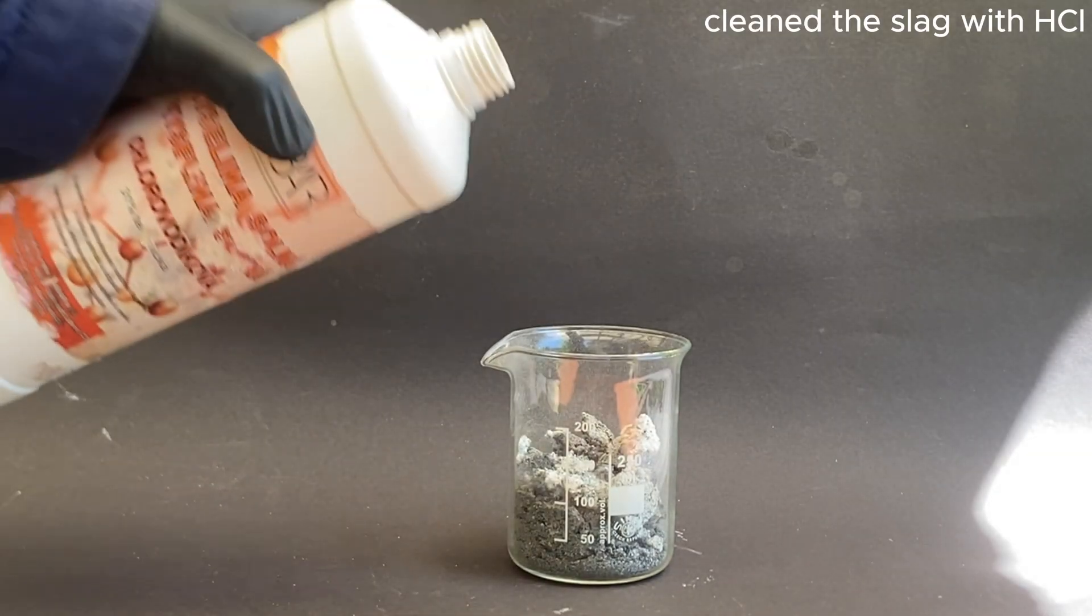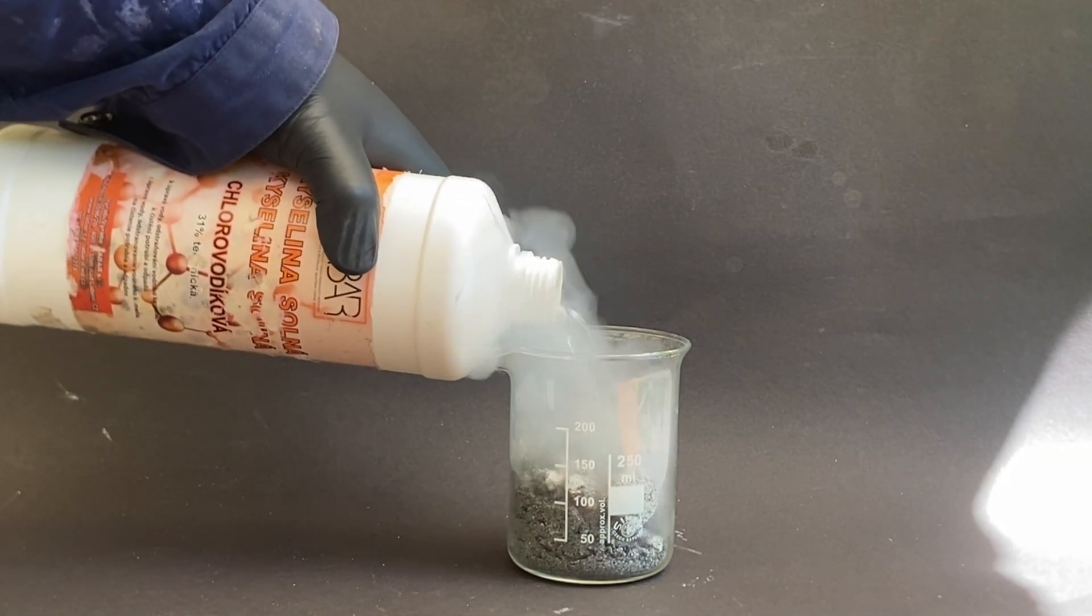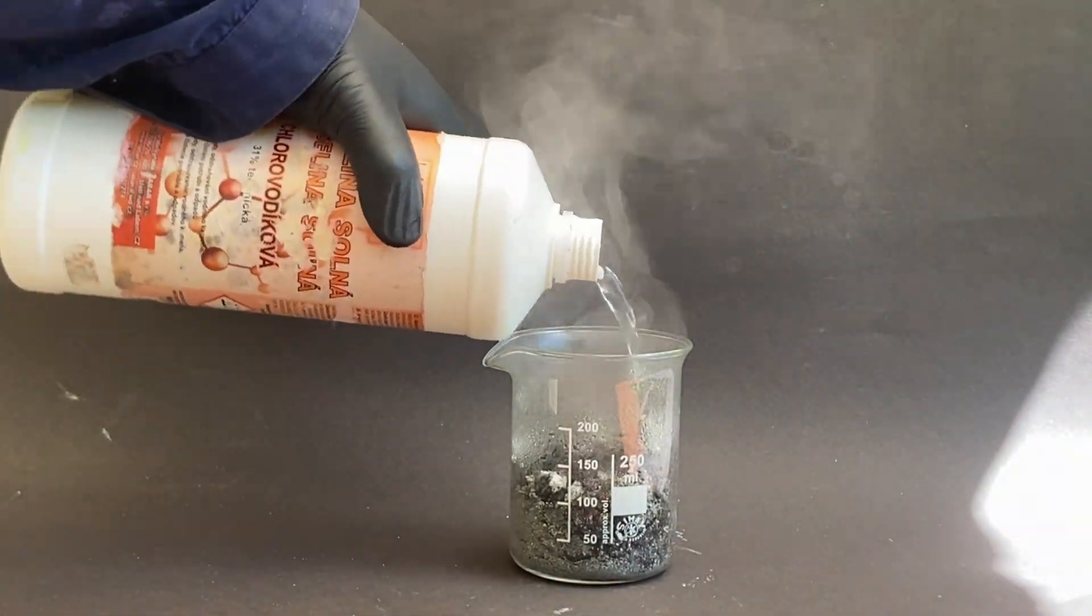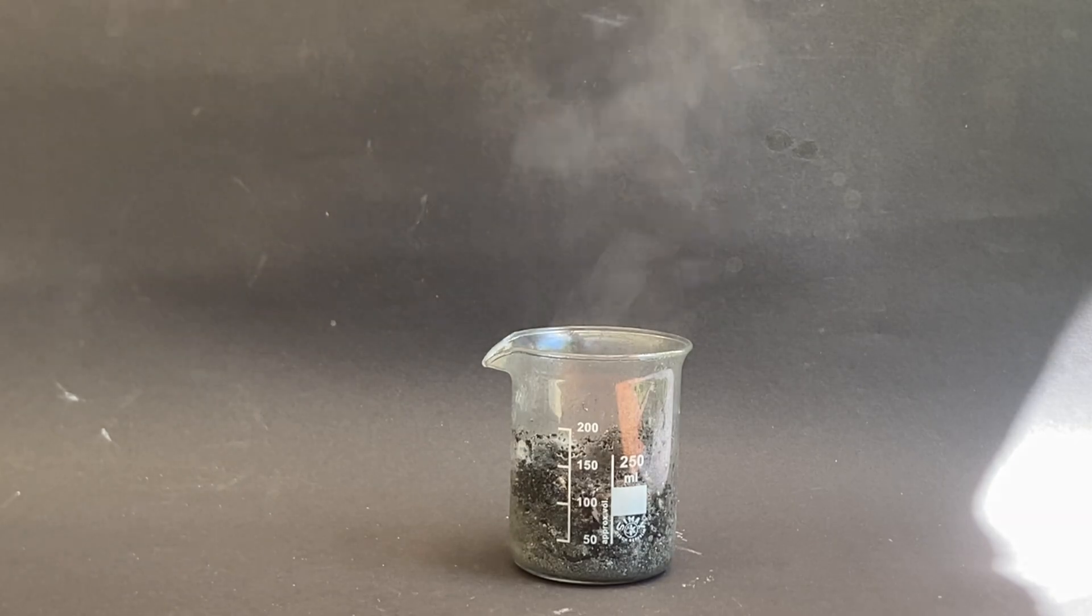Next I dissolved the magnesium oxide in hydrochloric acid. This reaction was quite violent because I didn't let the slag cool down enough and nearly resulted in my beaker overflowing.